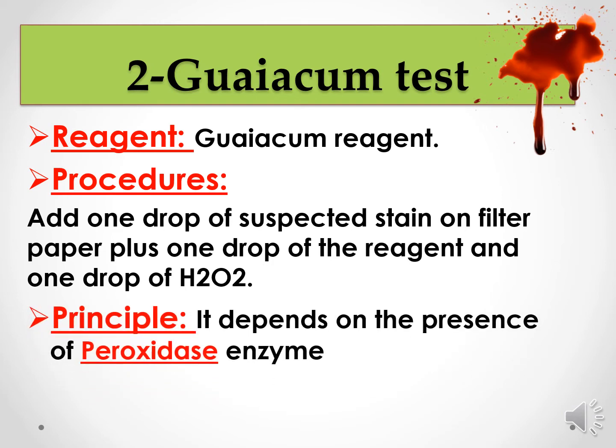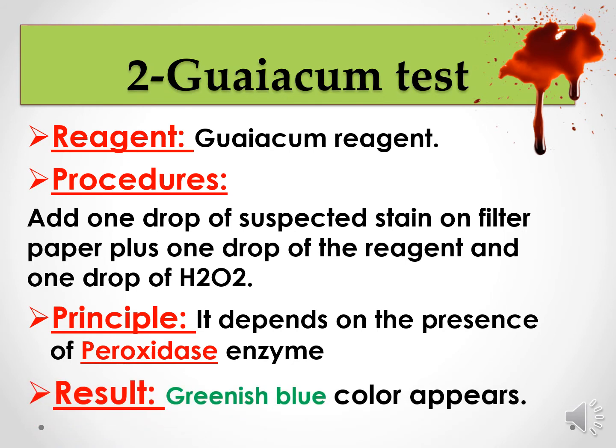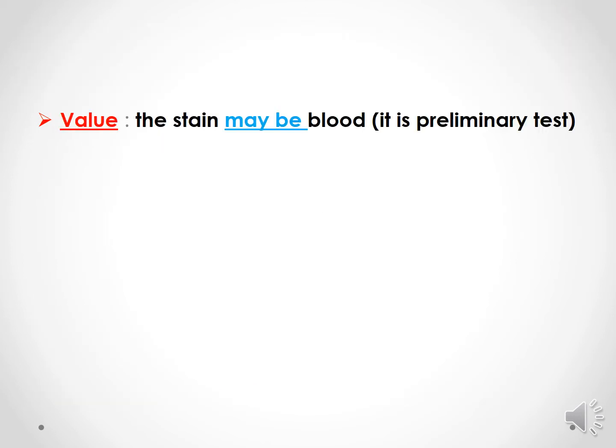Principle: it is also one of the screening tests, so it depends on the presence of peroxidase enzyme. Result: greenish blue color appears.